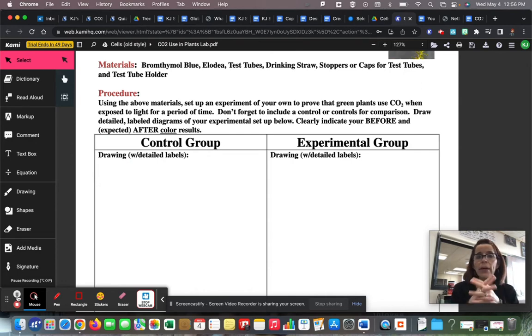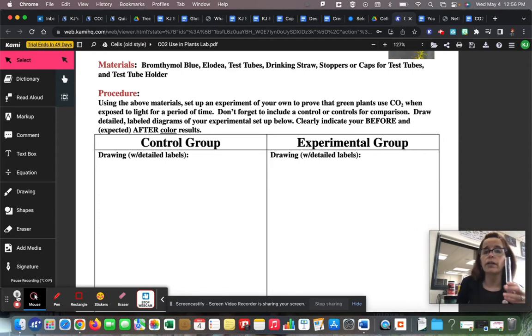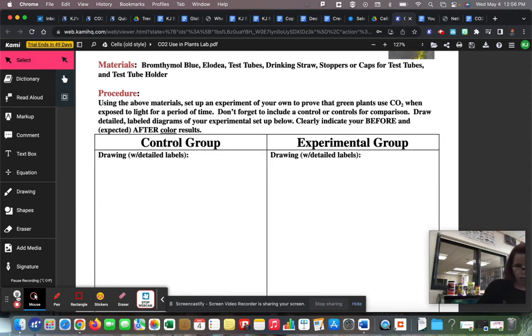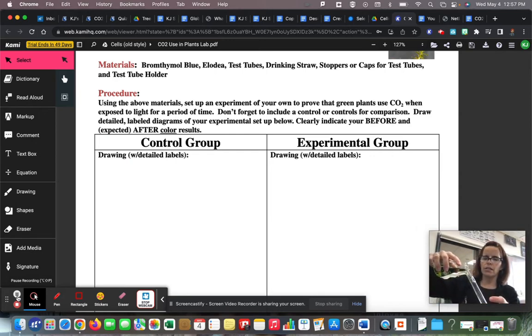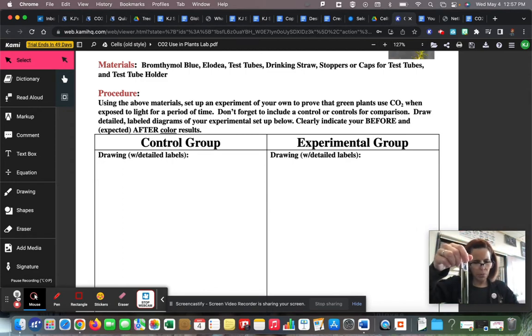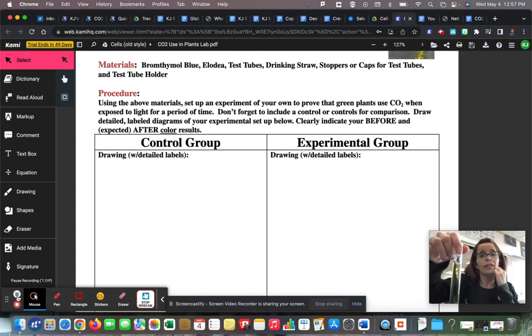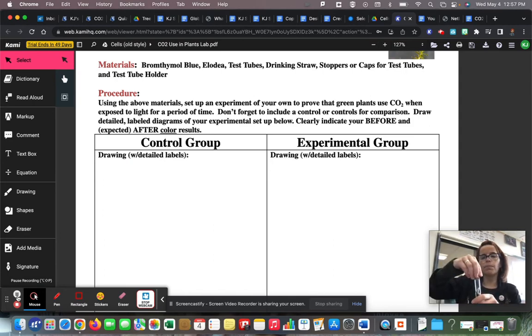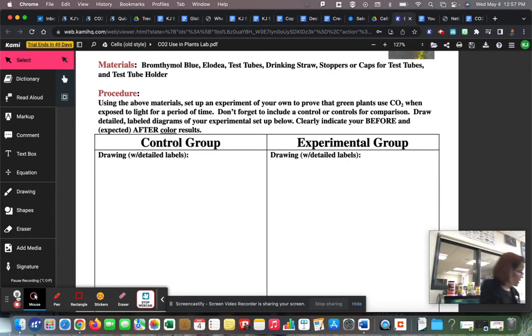Now we have water with carbon dioxide in it. We're going to have two test tubes. One test tube we're going to call our control group — I'll pour this in. It turned blue briefly and now it's going back to yellowish green. Now I'm going to add the plant to the second one. Here's my plant — I'm going to push the plant down. We're going to put the plant in the sunshine for about half an hour.